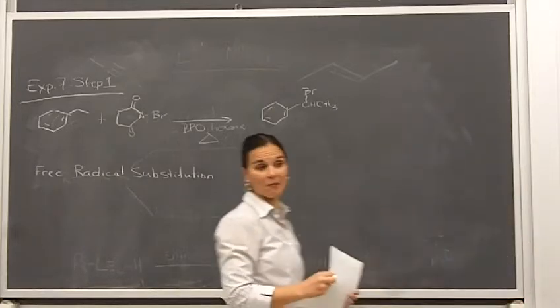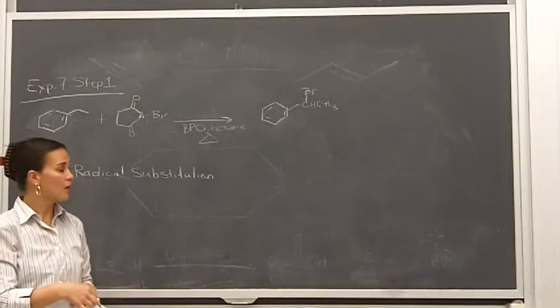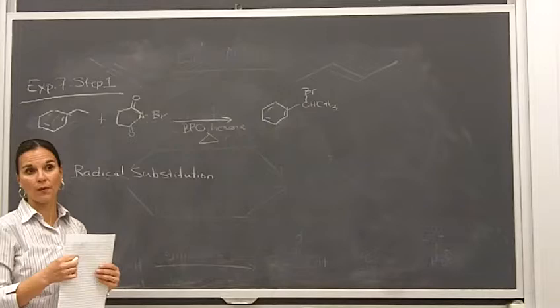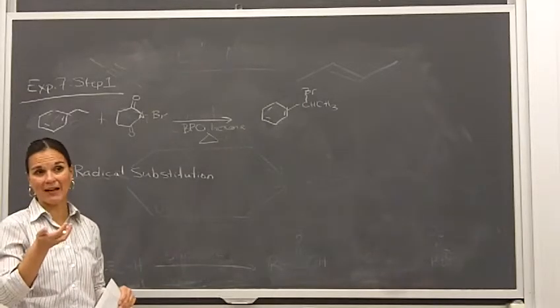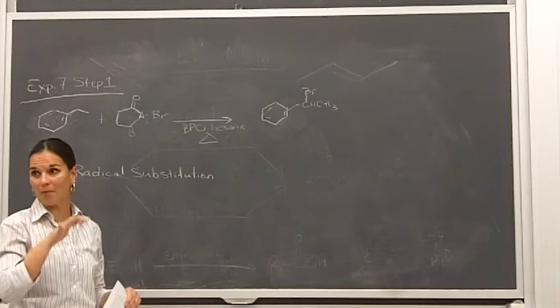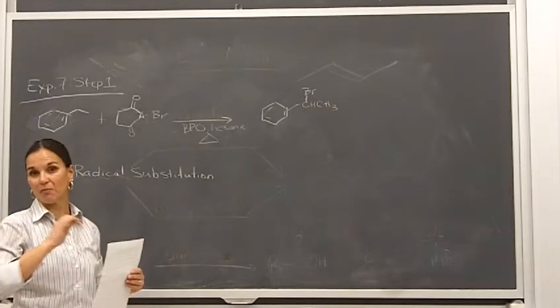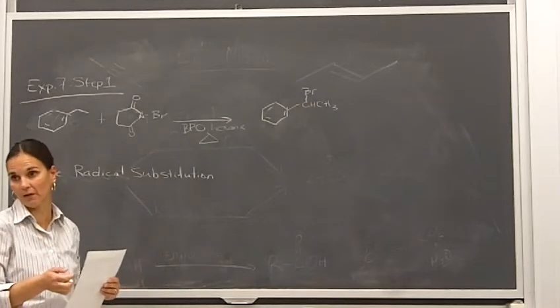Then it may get a little bit warm. You'll start seeing it all of a sudden refluxing more. You may be turning the heat down because it gets going so rapidly. But after that, you'll still have to keep an eye on it, because it will calm back down again, and you want to make sure it doesn't completely stop refluxing on you, and that you have enough heat on it.